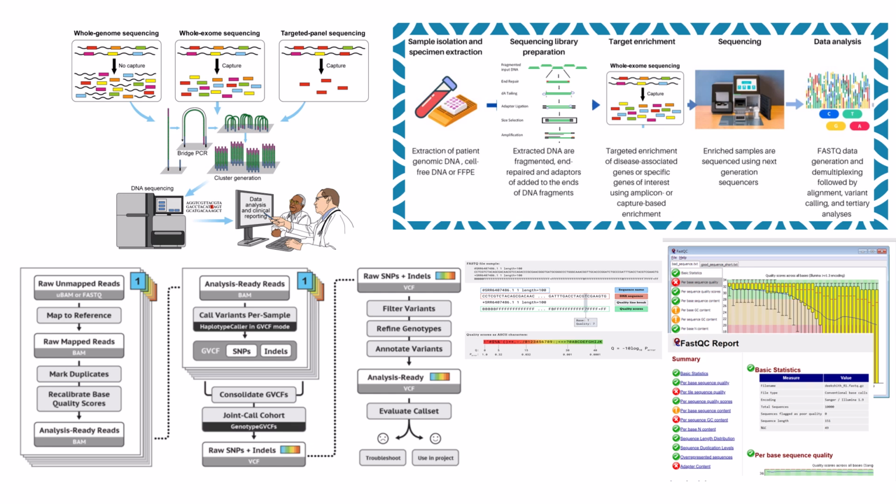Well, the whole pipeline really culminates in the creation of that actionable genetic report, or at least the data that forms its core. But before the final files are stored, there might be a couple more quick analyses. Like what? Sometimes additional scripts calculate detailed sequencing coverage statistics across specific genes or regions of interest. This helps confirm you actually got enough data in the key areas to be confident about both finding variants and not finding variants, basically assessing the completeness of the analysis in critical spots. They might also run some final genotype refinement steps. Just adding those last layers of quality assurance.